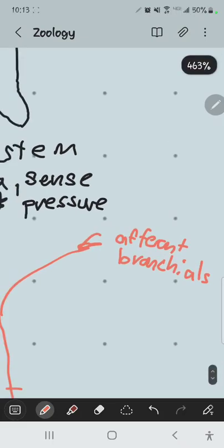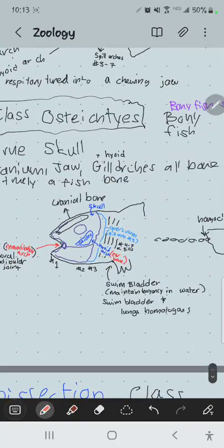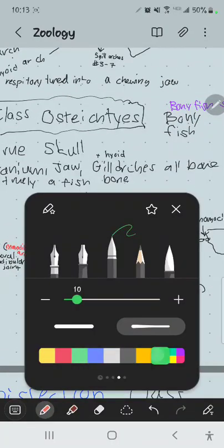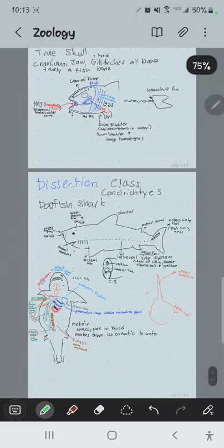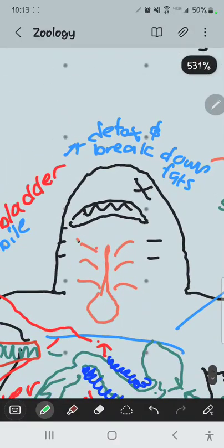And then behind this, which is kind of important to see, is a structure called a sinus venosus. The sinus venosus is basically like the freeway merging system of the return venous system.